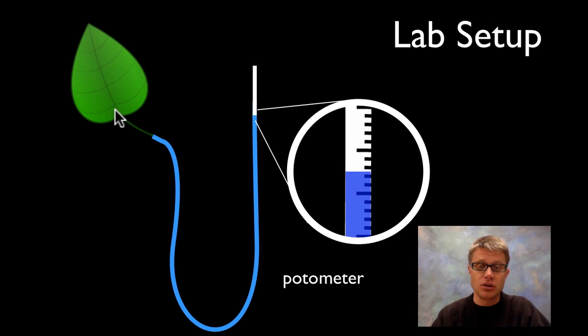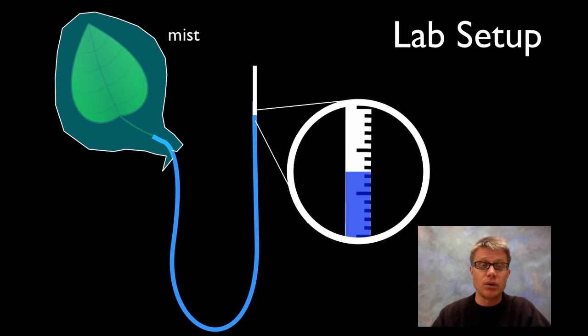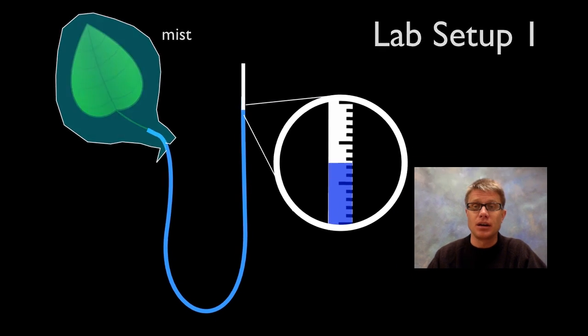Let me show you what we have. This would be our standard lab setup, basically setup in your lab ready to go. We then compare that over time to the following. We have another one where we put that leaf inside a bag and then we put mist inside the bag.